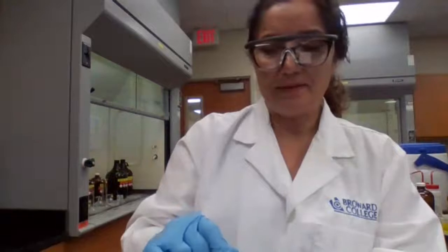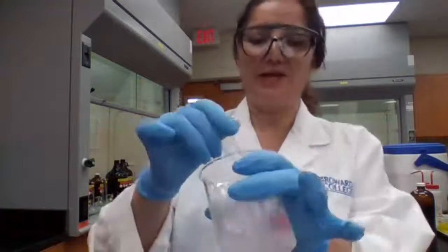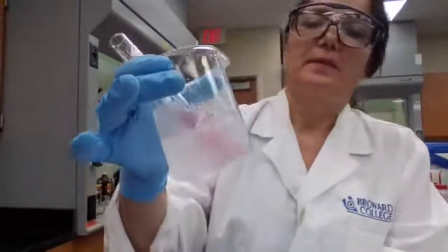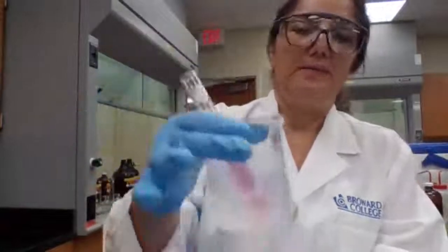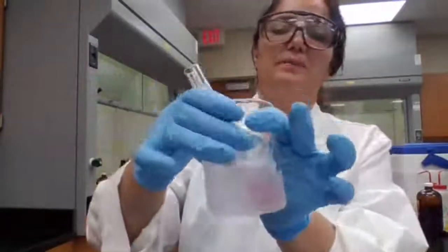Heating it up, it changed to blue color. So if the product is blue color, that means heating up the reaction made it go to the product side. Okay, placing in ice, it changes back to pink color.